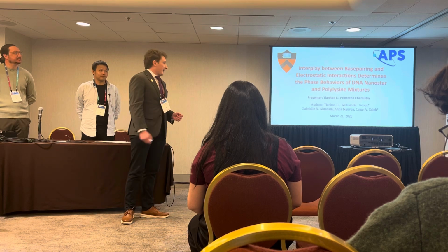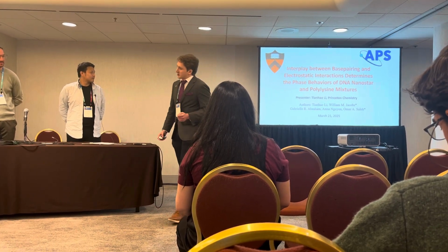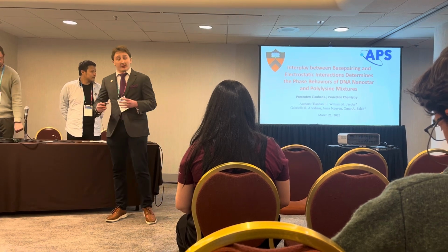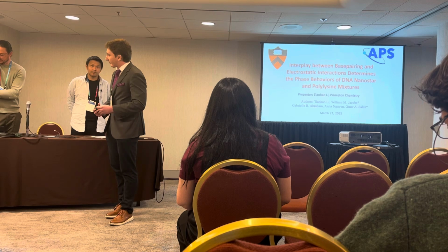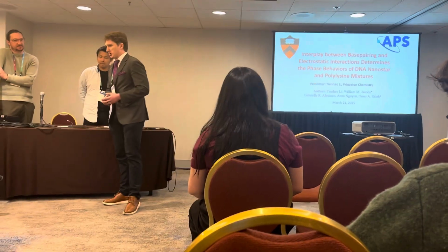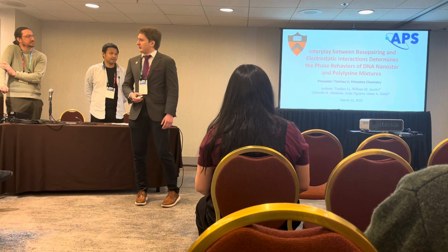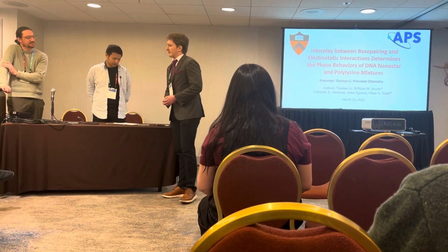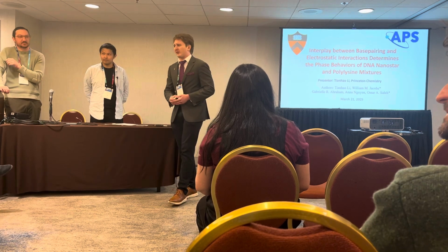In fact, when I go and I get these concentration measurements, I intentionally knock down the salinity of the solution by a factor of 100, such that the nanostar structure itself is unstable, and I can just measure raw oligo strands instead of this macromolecular structure. So while no doubt there may be some moieties here and there, I'm not particularly concerned about that many differences in the structure of the stars, because we've used HPLC purification, and they have some really great standards on the actual sequences.